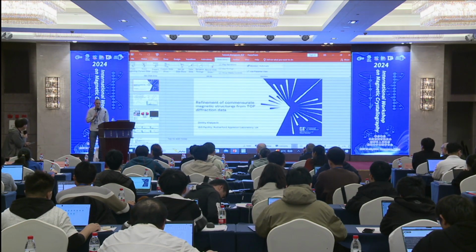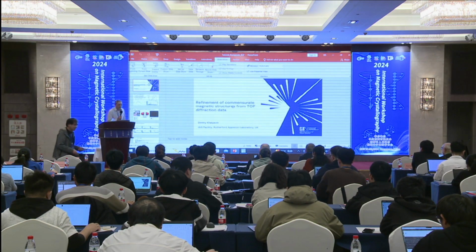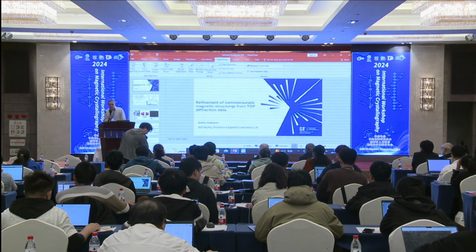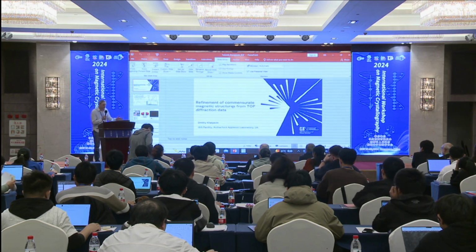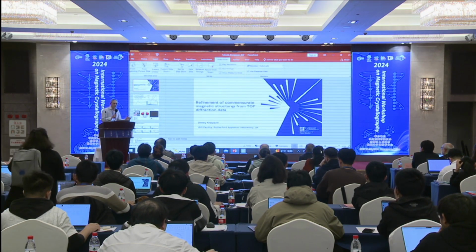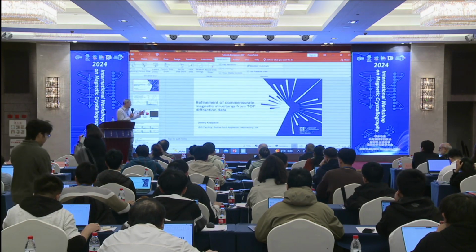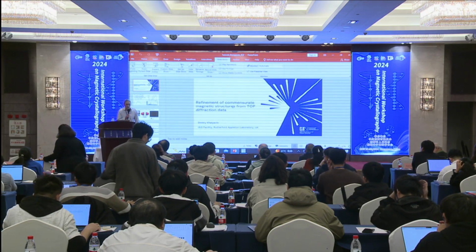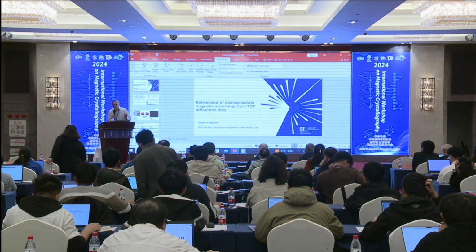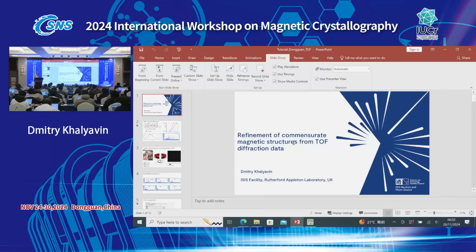Okay, thank you so much for inviting me, and thank you so much for a nice introduction. Good afternoon, everyone. So today we will be trying to refine some magnetic structures using commensurate time-of-flight neutron diffraction. The data we will be looking at were collected on the WISH beamline at ISIS Target Station 2.